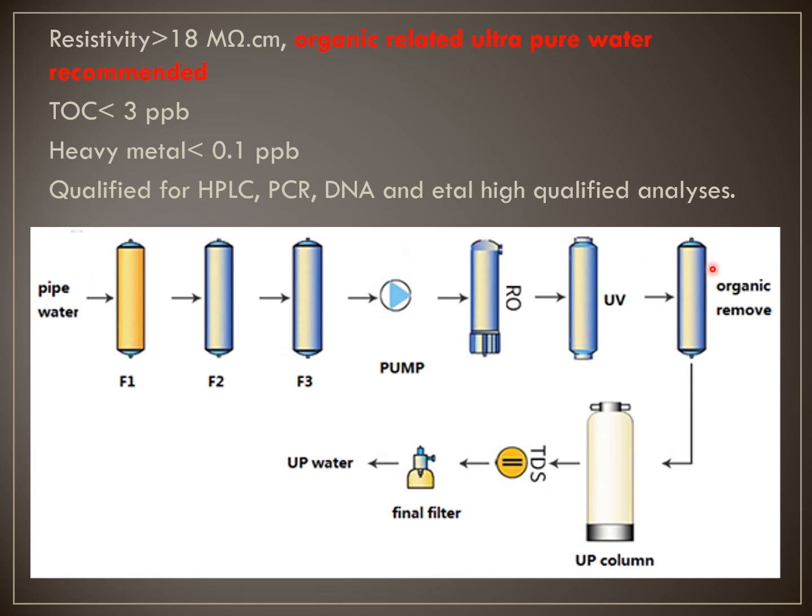research. You install an organic removal column, and you also control bacteria with UV. So at this time, you install pretreatment, RO, UV, organic removal, and ion exchange column. After the water comes out, it will be suitable for HPLC, PCR, DNA, and other related analysis.